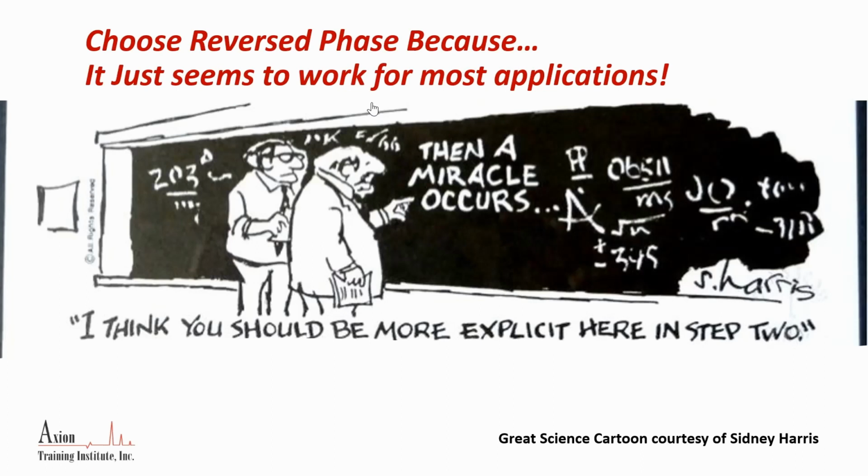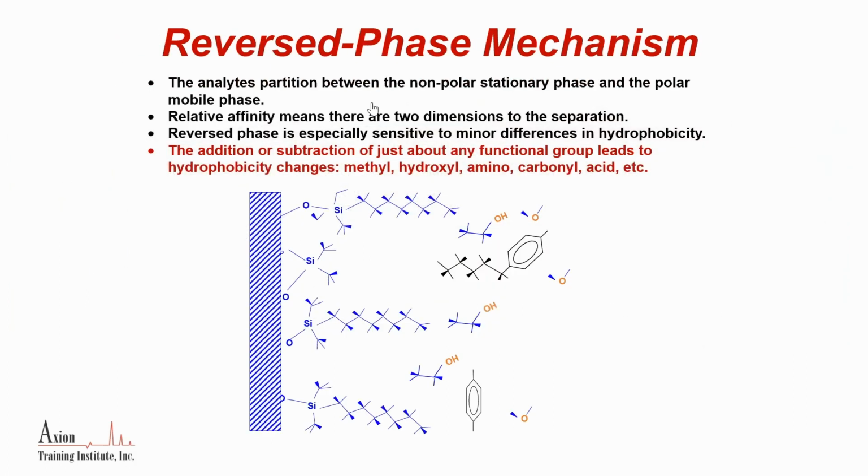So reverse phase is hydrophobic interaction. It is how nonpolar is your molecule. So no matter what change you put to a molecule, you are going to change its hydrophobicity, you will change its retention by reverse phase. So that's why reverse phase is what I call almost a universal approach at separations. So we've got good efficiency, we've got our good selectivity with reverse phase.